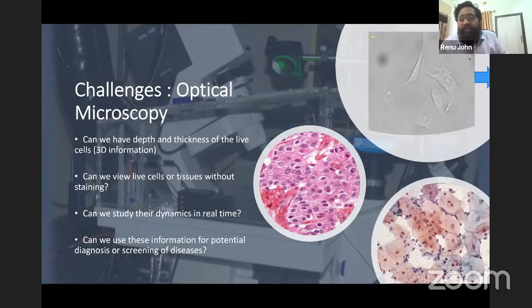We are essentially looking at the condition of the cells, what is the type, structure, morphology, are they actively dividing? Some of the features which clearly show the signatures of a cancer and similar things. Apart from that, microscopy might be used heavily in stained applications like fluorescence microscopy.